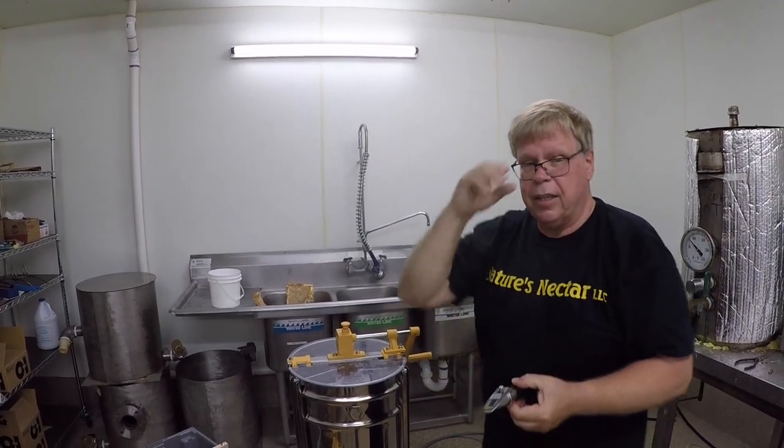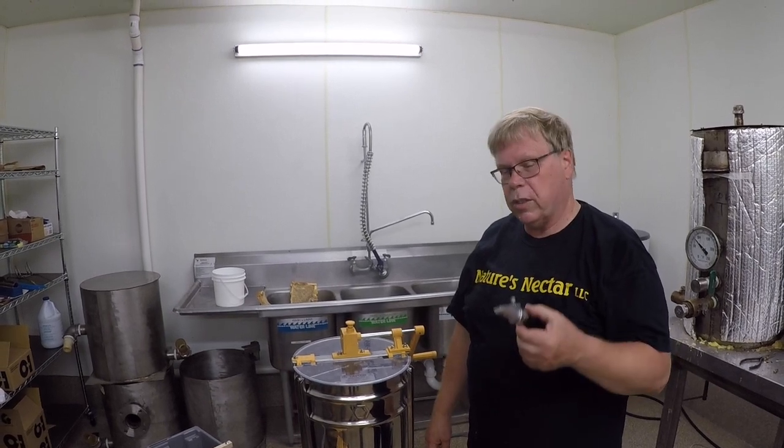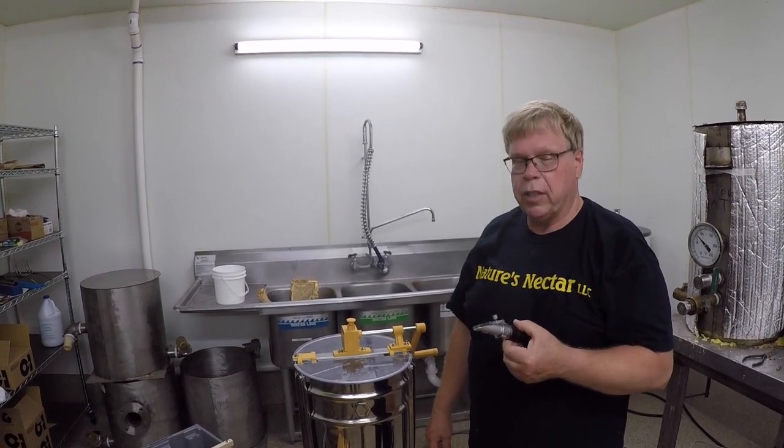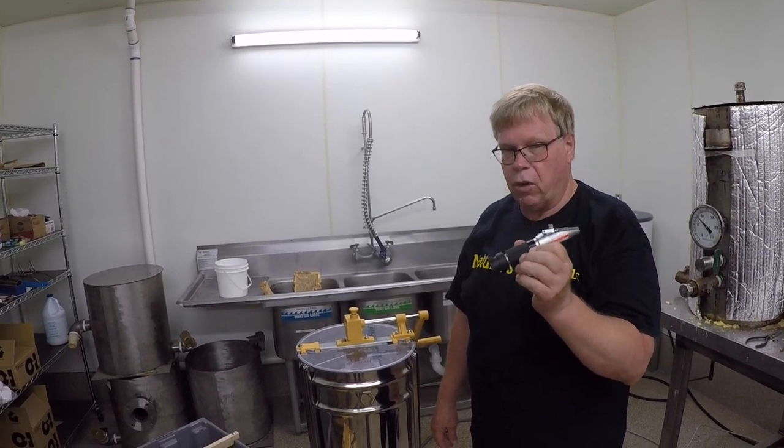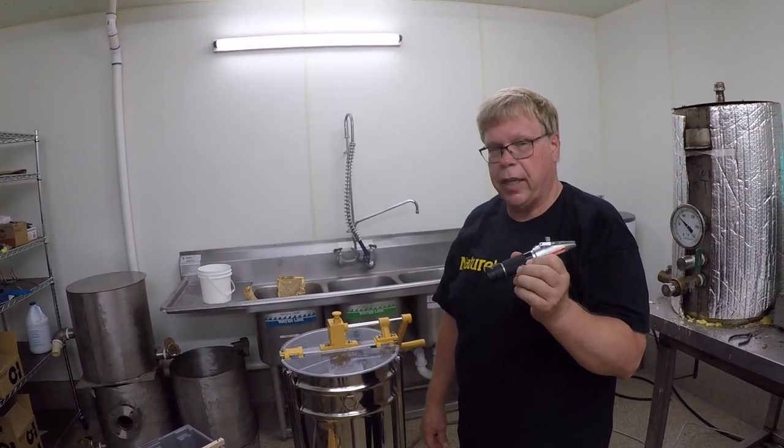US grade A is 18.6% or below, so this honey is US grade A, and it's perfect, and it'll stay like that for a long time as long as it's in a covered container.